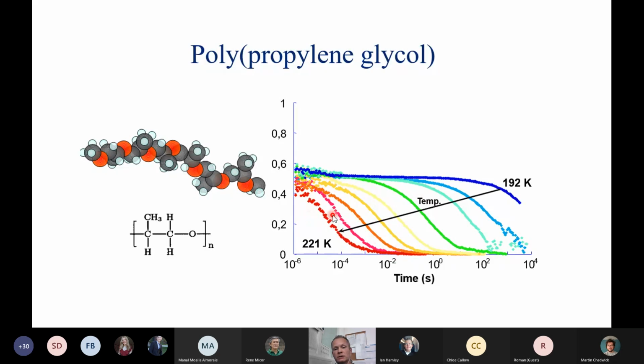And this correlation will be dependent on temperature. In this case, you have not a solution, you have just a bulk material, and inside of this bulk material you have some kind of thermal motion. So dynamic light scattering will show you correlation, right? It will show you some non-zero correlation function.